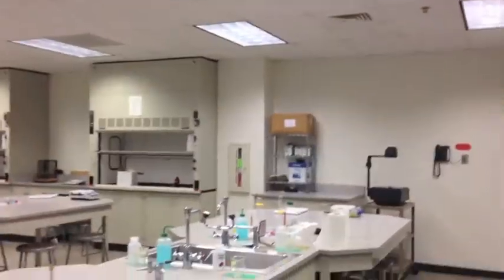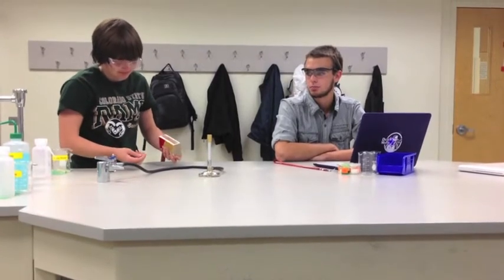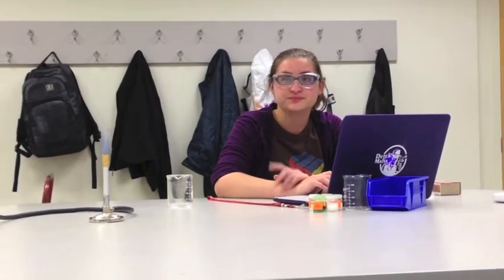The fire extinguisher is over there, above the burner tube. Also, a safety concern: never drink in lab.